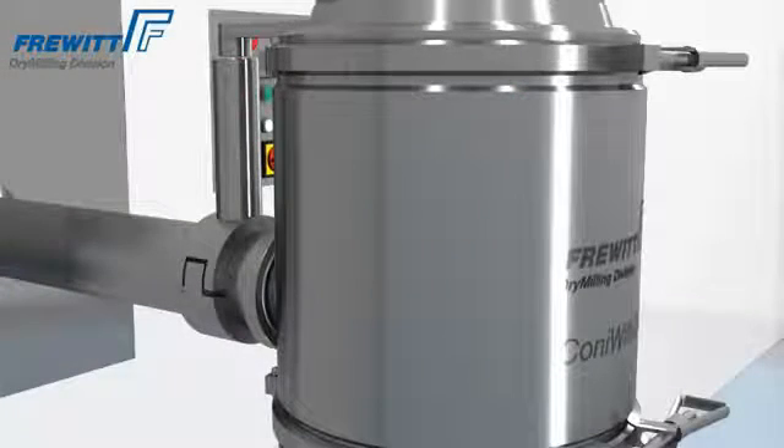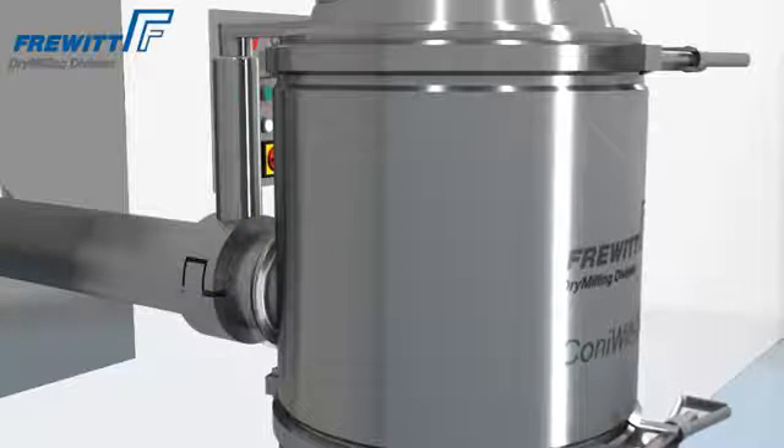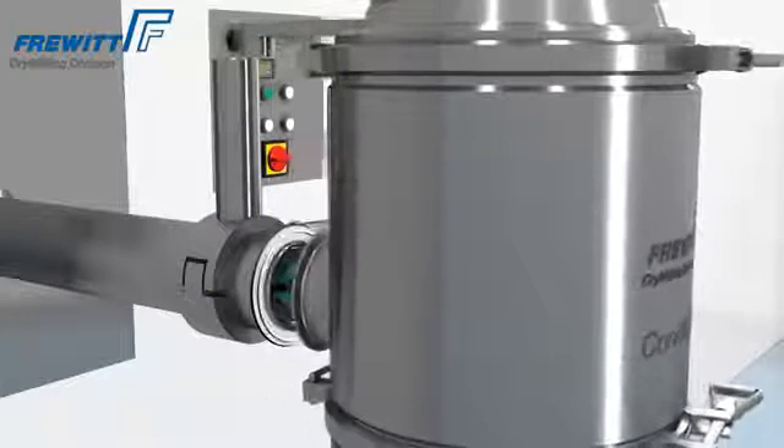The newly developed swivel arm for inline production is the perfect solution for limited space installation locations. The mill device can be easily swiveled away after removal of the locking ring.